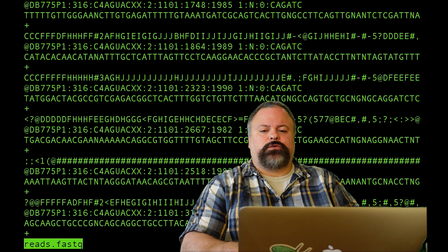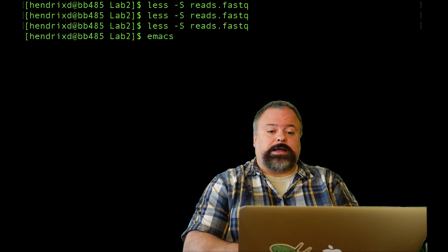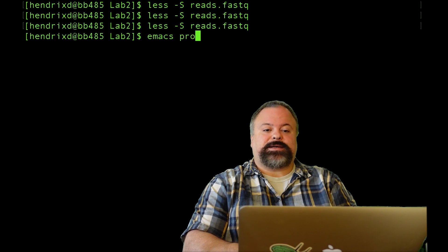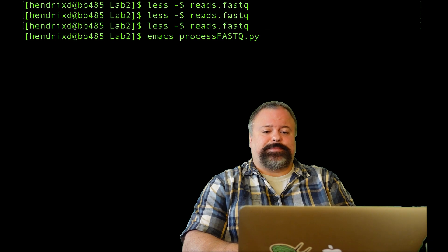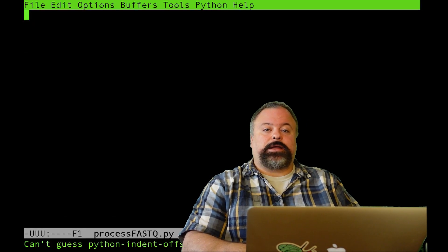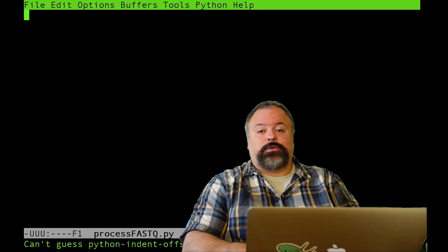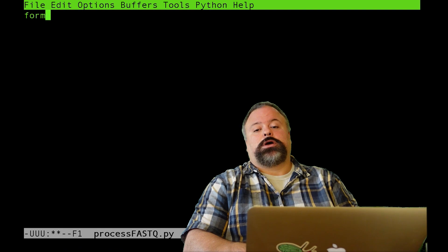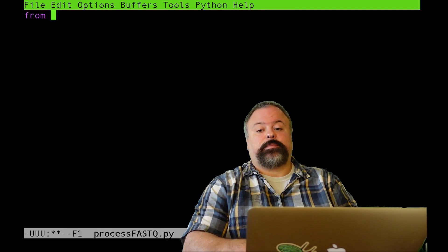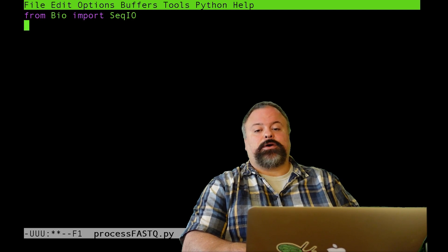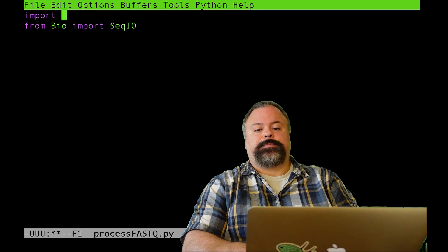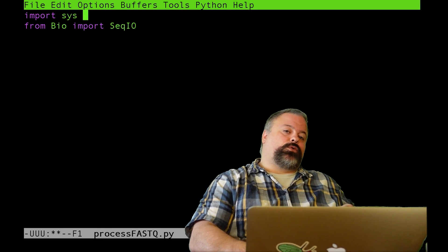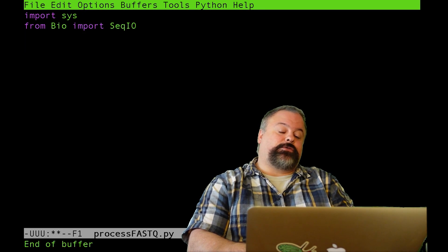First thing we want to do is we want to define a script. So I'm just going to define a script with Emacs here, and I'm just going to call it Process FastQ. And this is just an example that I'll just show you how to basically loop through the FastQ file and extract information. So, first thing we want to do is we want to import some modules. Definitely we want to import SeqIO, which is from Bio import SeqIO. So I'm going to go ahead and import sys, because I want to use some sort of interface.